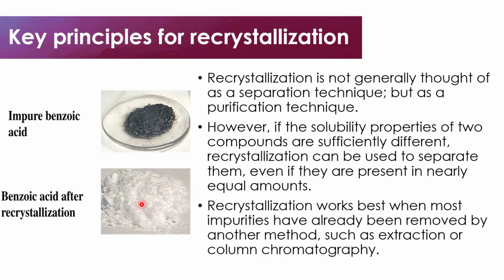Once again, we also have to notice that recrystallization is not generally thought of as a separation technique, but as a purification technique. However, if the solubility properties of two compounds are sufficiently different, recrystallization can be used to separate them, even if they are present in nearly equal amounts.